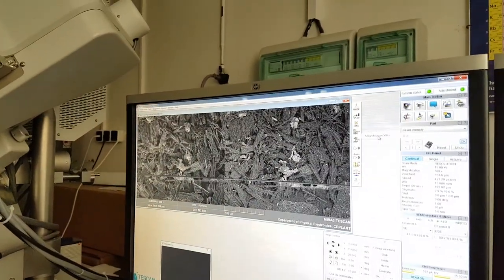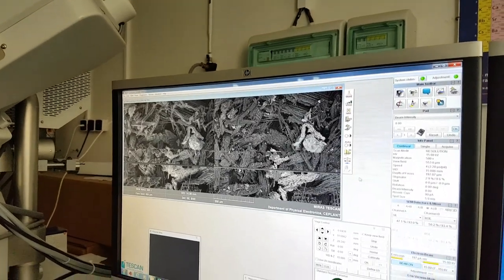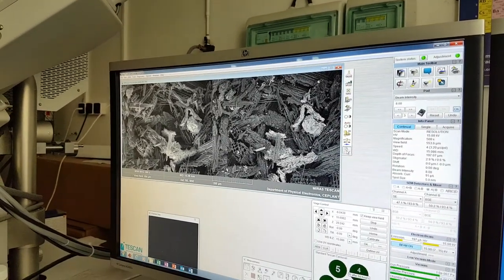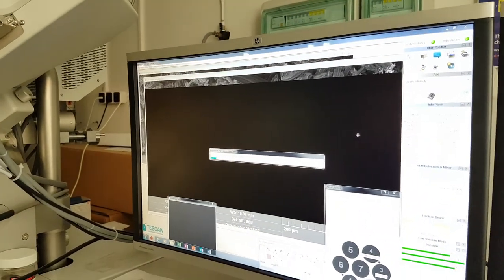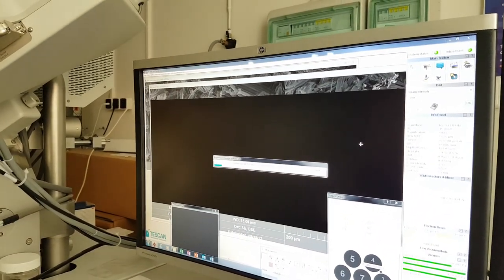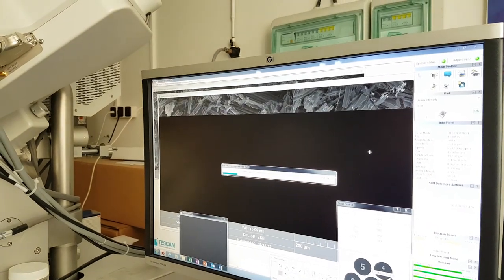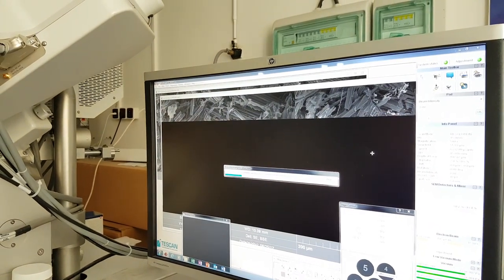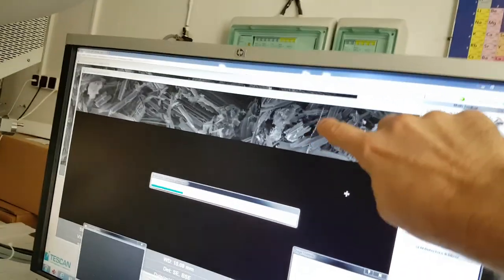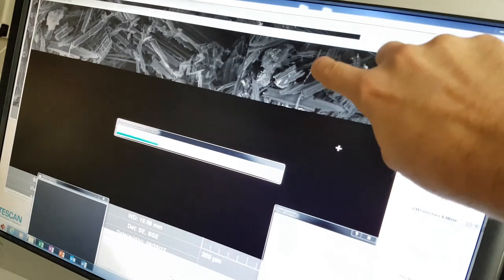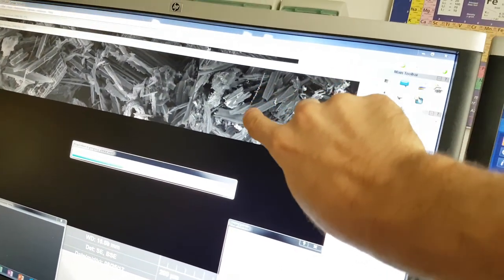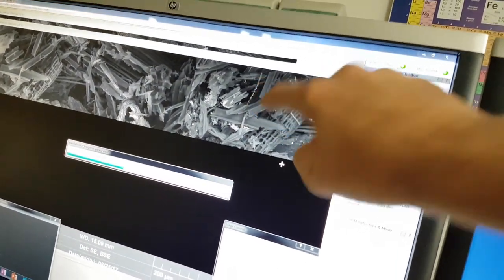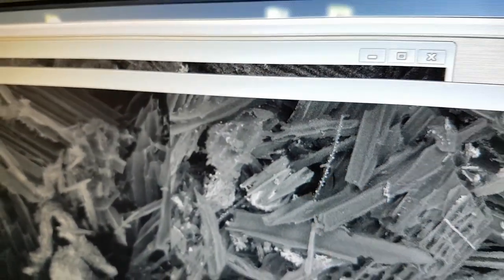A little bit bigger magnification. Yeah, okay. That's good, yeah. Let's see what we have there. Wow, look at this little strand here. Beautiful, with little balls on it. You can see that there. Let's do a map of this whole area and then let's have a look at this one later.